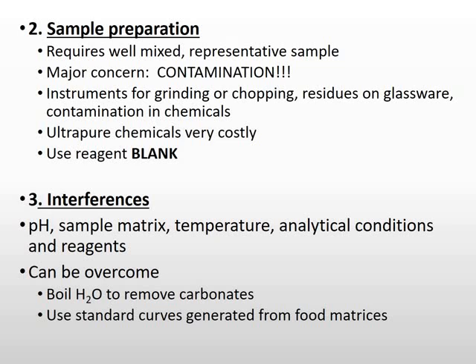But very important is that whilst you are doing that sample preparation, you prevent any contamination, because you don't want to be analyzing for salt or for iodine or for aluminium, and then the dish that you are using to collect the sample is also aluminium. It's an aluminium dish, but you are also looking for aluminium in that product. So the shavings from the aluminium dish might contaminate your sample. So it's very important that you note the things that might contaminate your product.